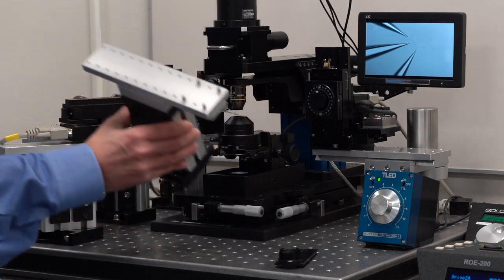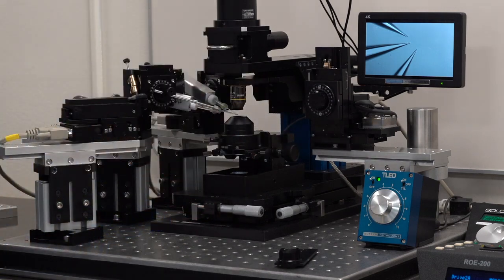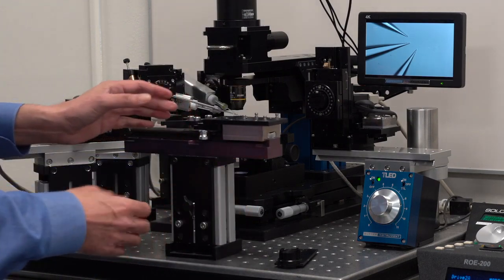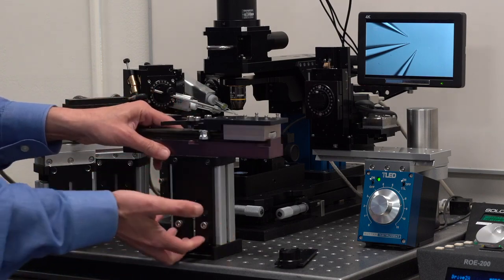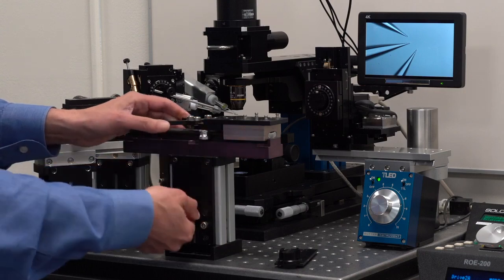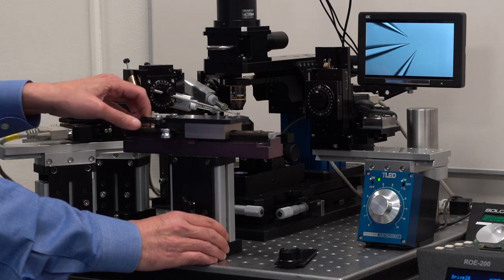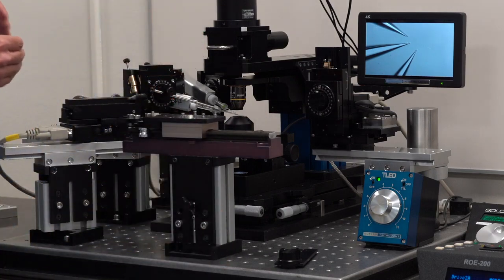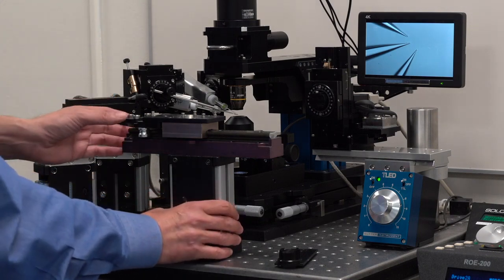Now, we have, in addition to just a simple regular stand, we have one with a linear slide. The problem with the linear slide is it has the same features, by the way. It can be rotated. The height can be adjusted. But the linear slide, one can have the manipulator here and pull back on the whole manipulator. By getting further away from the setup, again, pipette changing will become easier.